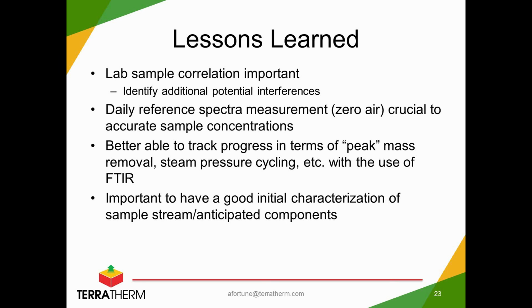It's also important to have a good initial characterization of the sample stream or anticipated components. So that goes back to the information that you have about the site and the characterization of the site before we even start the project. What components are going to be there, what's in the subsurface, what's going to be coming out as we heat it up. So it's really important to have that information as well.